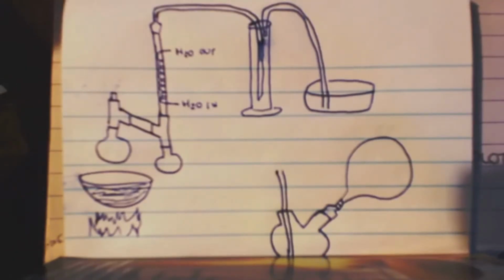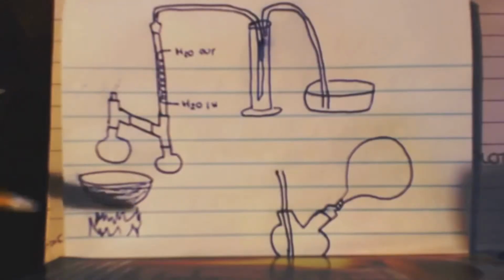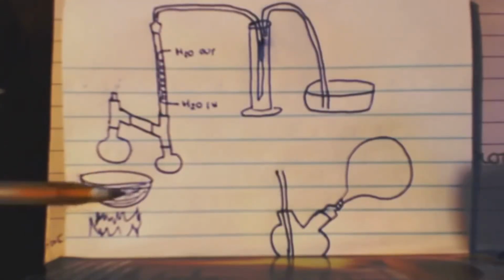Now this is the apparatus I'd make. You can see I got my flame. This is an oil bath.